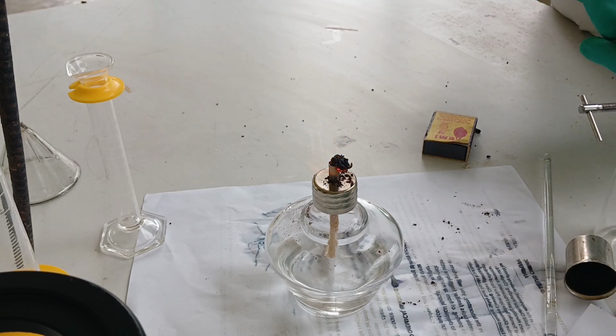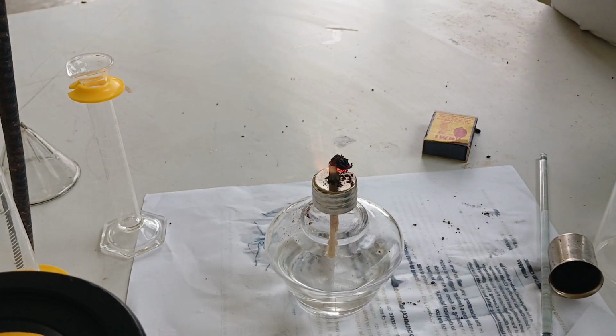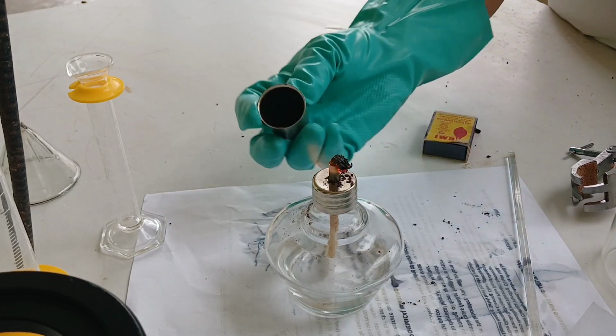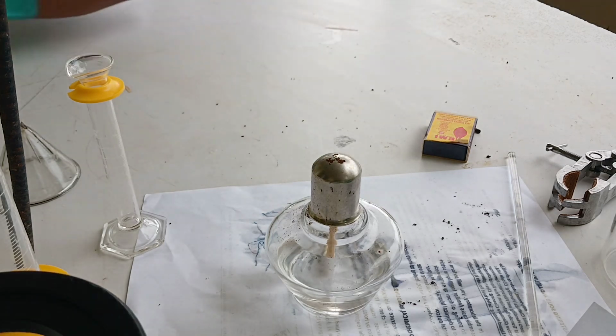Transfer that and put it in the test tube rack, and the flame is still ongoing. What you have to do is kill the fire using that lid. Just cover it directly, just like that. That's it. So that's the way you would heat liquid inside the test tube.